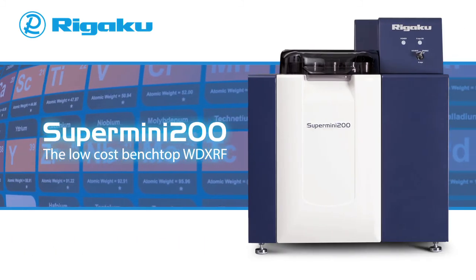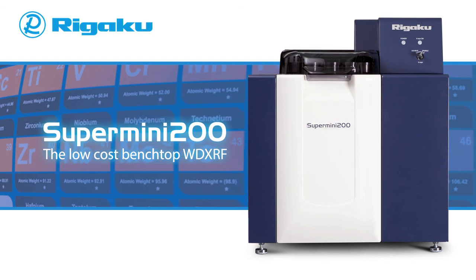For more information about Rigaku's new Supermini 200 WD-XRF system, please visit www.rigaku.com/supermini200.